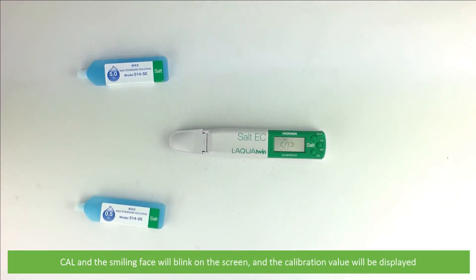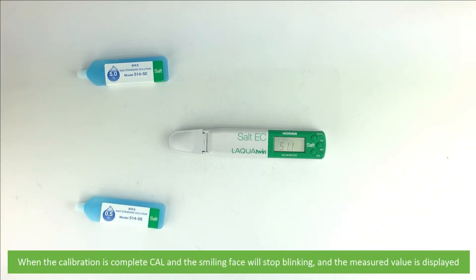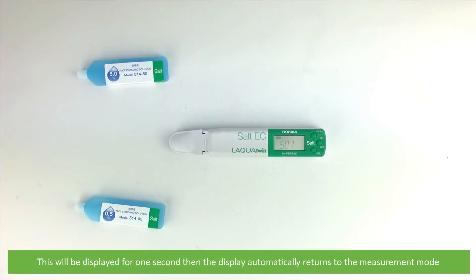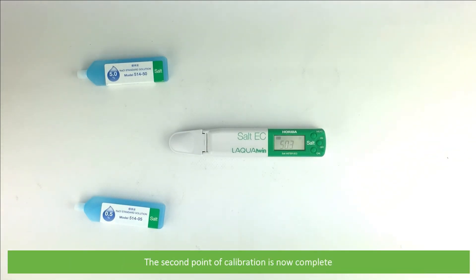Cal and the smiling face will blink on the screen and the calibration value will be displayed. When the calibration is complete, Cal and the smiling face will stop blinking and the measured value is displayed. This will be displayed for one second, then the display automatically returns to measurement mode. The second point of calibration is now complete.